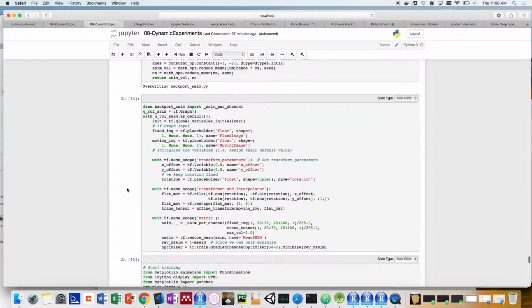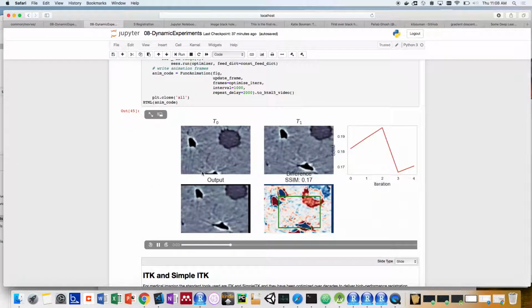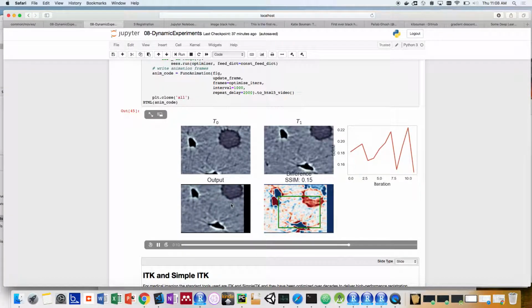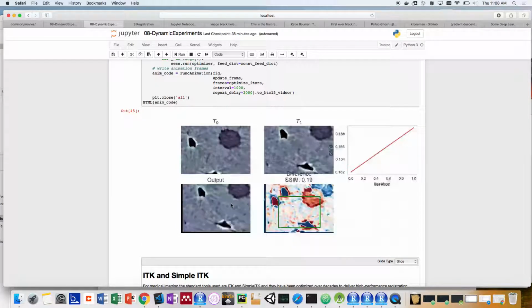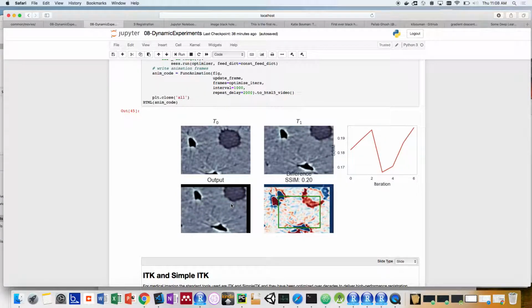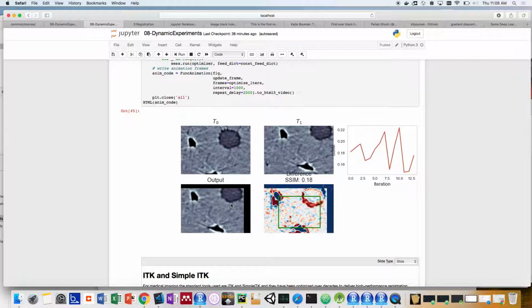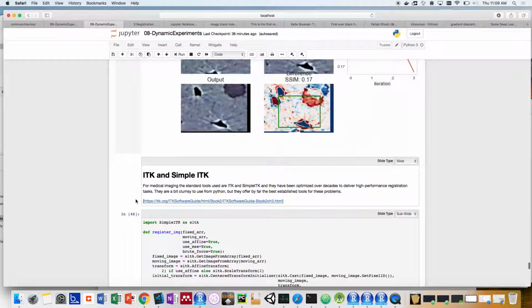Similarly, we can use better features like SSIM, where we can take the SSIM score on the raw image and get a model that does a much better job of converging. So we see that there's still a little bit of instability, so it doesn't always go in the right direction, but that it moves towards the optimum value because the SSIM is a much better indicator of where the maximum is and has a much smoother gradient than just using mean squared error for this problem.